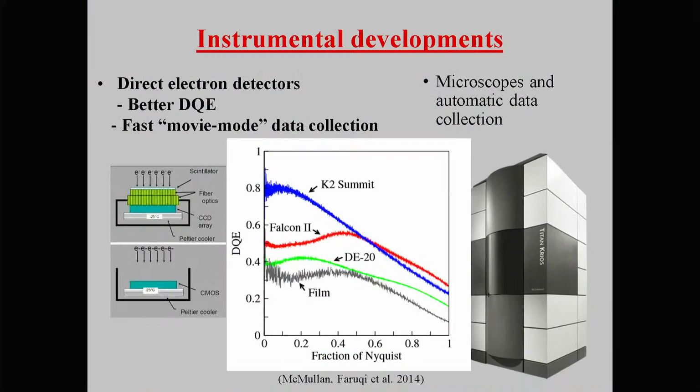And one of the nicest pictures that I've seen in papers was by FEI, where they said they measured. I don't know if this was a follow-up to this paper from the group of Cambridge, where they told these people that wrote this, well, we built the camera and we measured a DQE, and our DQE is actually 20% lower than you say it is.